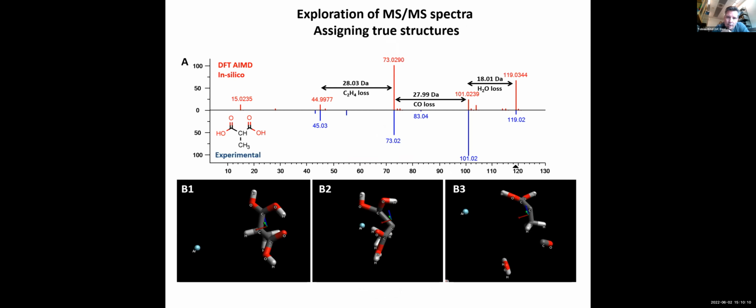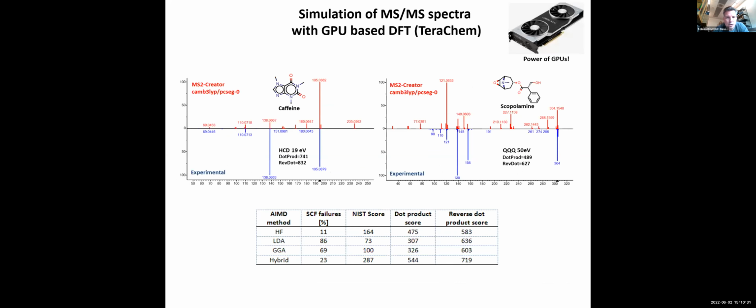Now consider a molecule that you have never seen before, a complex natural product. And it's very hard for experienced mass spectrometrists to even explain those reactions. They can do that on paper, but having an ab initio model with a very accurate method, DFT, can give you really all the information.